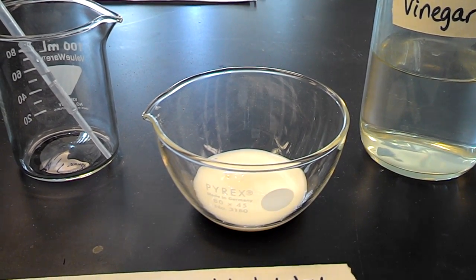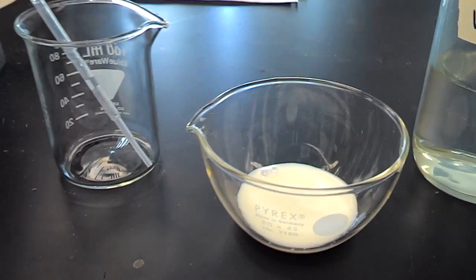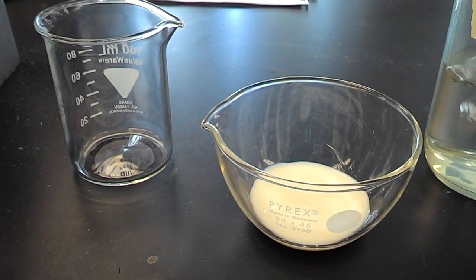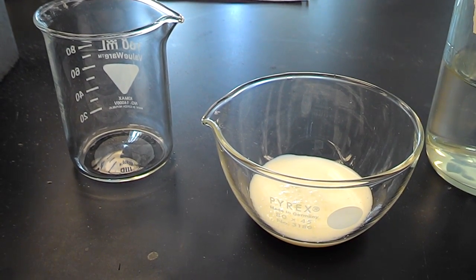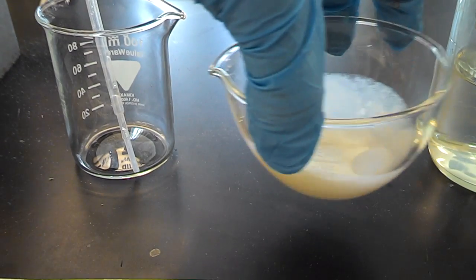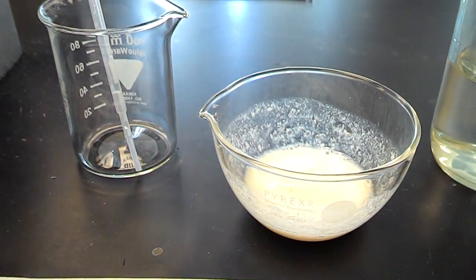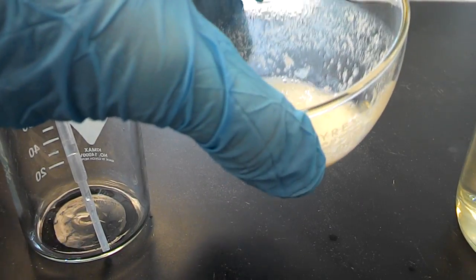All right. Make your observations of the milk. A couple bubbles because of the air. But now you're going to add 3 or 4 pipettes of vinegar or acetic acid. So you're adding a white mixture to a clear, or a white solution to a clear solution. You would kind of expect it to be a little more dilute. And then it asks you to swirl. And it asks you to tilt the dish so you can see what's on the sides of the dish.